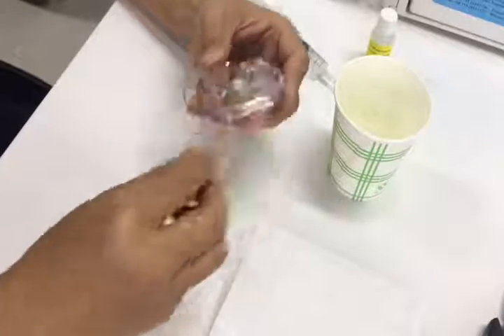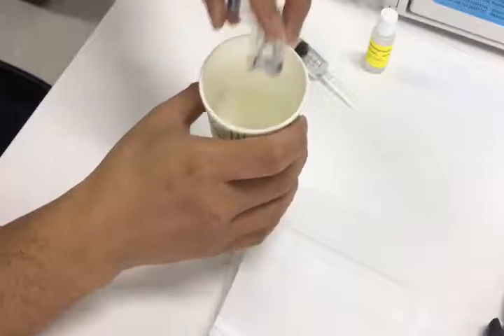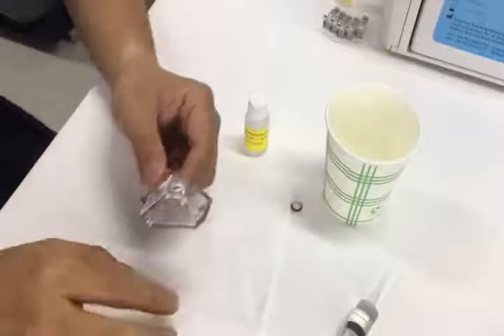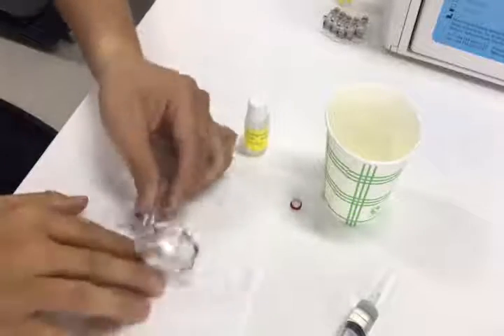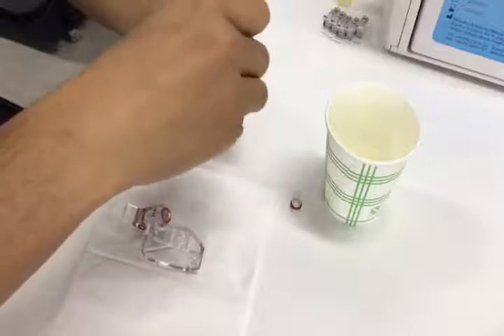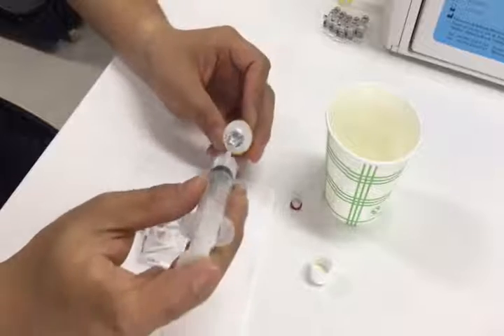Then we can take it out. Then remove the electrode solution out of the electrode. If the solution gets out, use the tissue to clean the outside. Then we use the syringe to get some solution from the reference electrode internal solution.